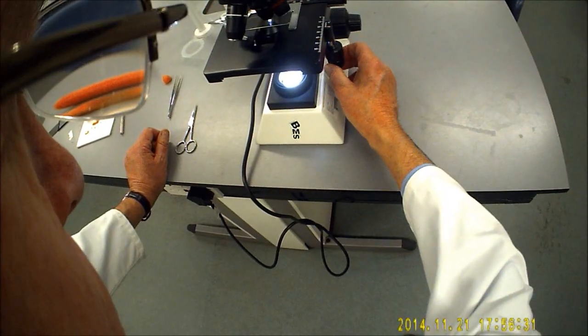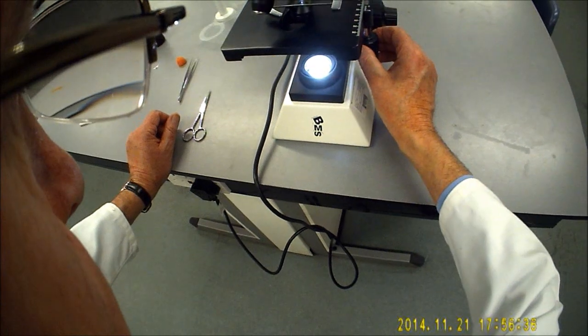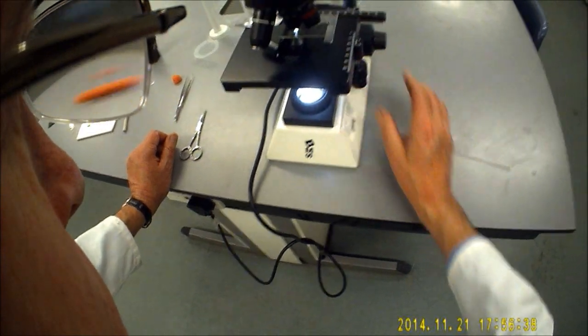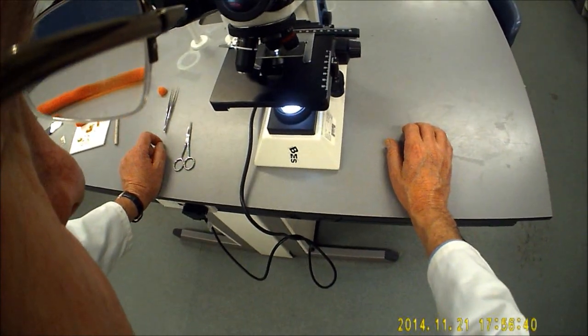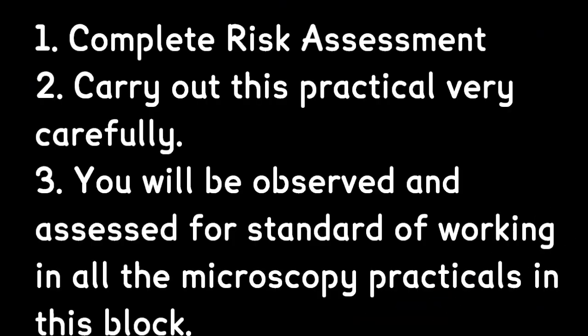And then I'm going to arrange that, and you might just be able to see the light shining through. Now I'm going to look down the microscope. Unfortunately I can't arrange it so that the camera sees all the room and I can see it through the mirror.